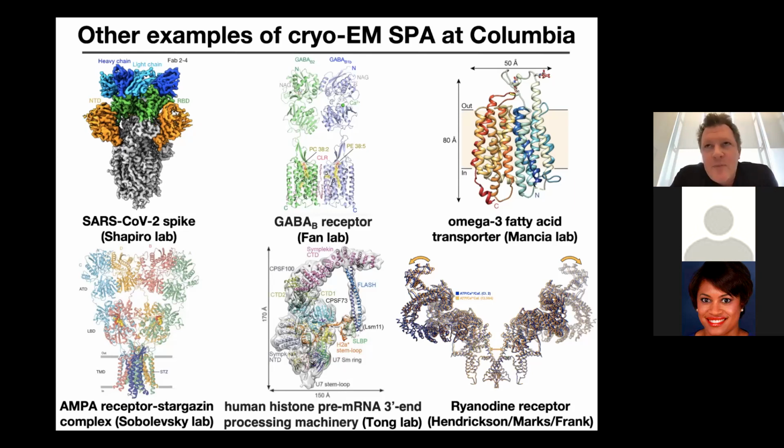Right. So that's why we pitched it for Cryo-ET. I think that for single particle, even the Volta phase plate, which was just mentioned, has now been demonstrated sufficiently that for single particle, you probably don't need a phase plate. The information is already there. And in fact, there isn't really much of a gain to be had, perhaps with small proteins, because you can perhaps infer the orientation better using a phase plate.